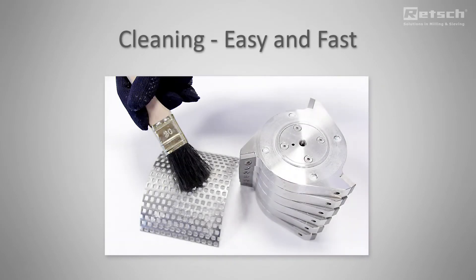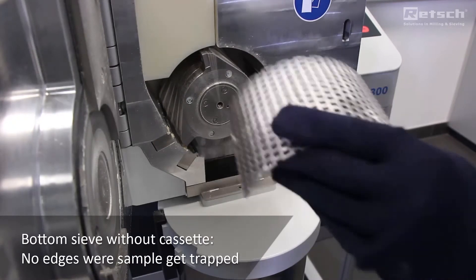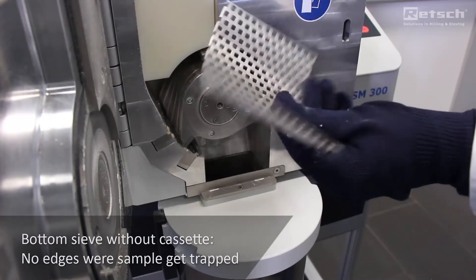Now we demonstrate the easy and comfortable cleaning of Retsch cutting mills. The bottom sieve has no sieve cassettes where sample gets trapped underneath the sieve.